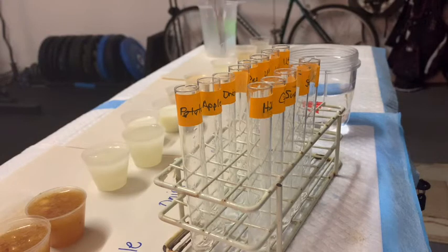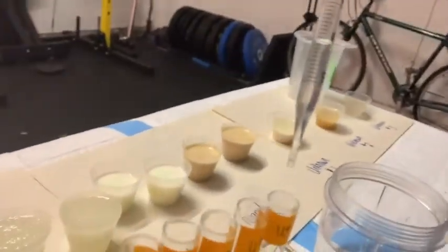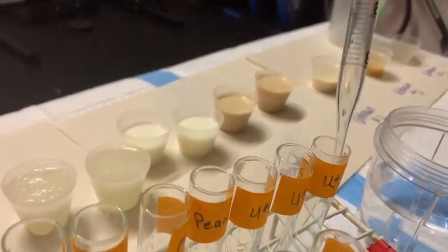The nice thing about serological pipettes and pipette aids is that you can do multiple samples over and over again. To show you the last one — we've got one mil of water left — I'm simply going to dispense it in there. There you go.